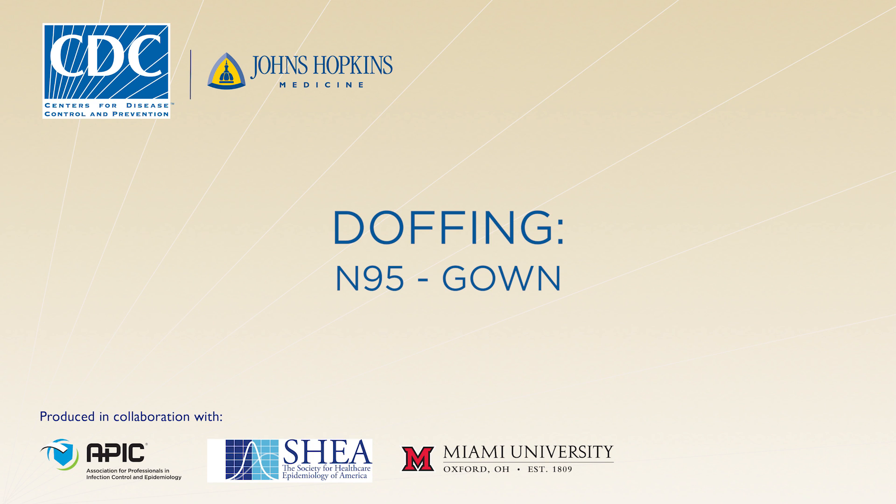In this video, you will learn how to doff or remove your personal protective equipment, or PPE, in accordance with CDC protocols. Following the doffing protocol will minimize the risk for disease transmission, so it's very important that you understand all the steps.